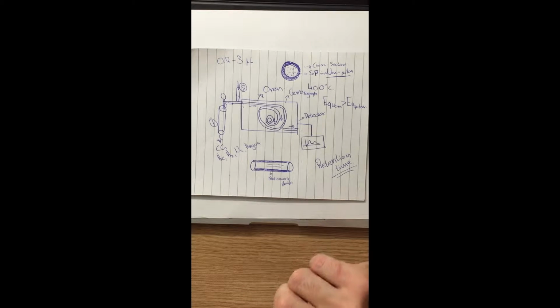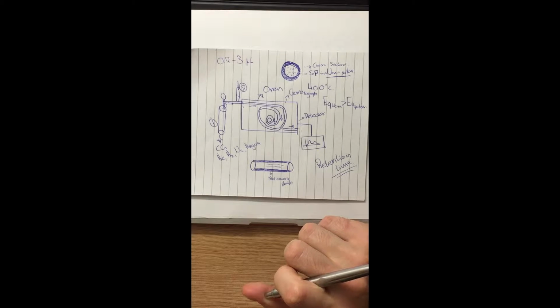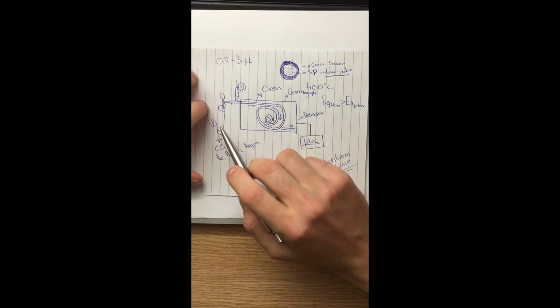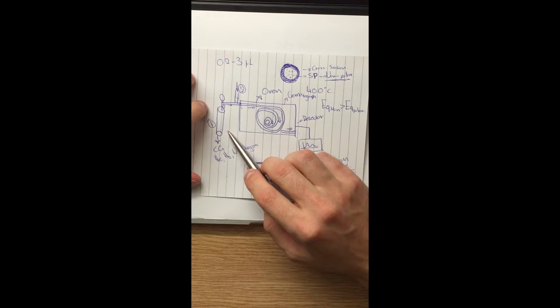Gas chromatography is used to analyze samples. All samples must be volatile because they have to vaporize in the oven. Now let's go through the 5 main components of a gas chromatograph.